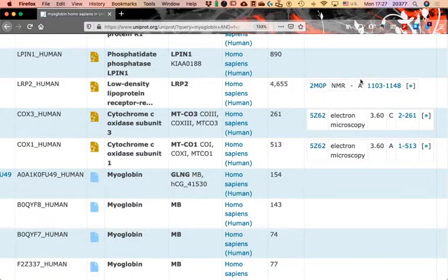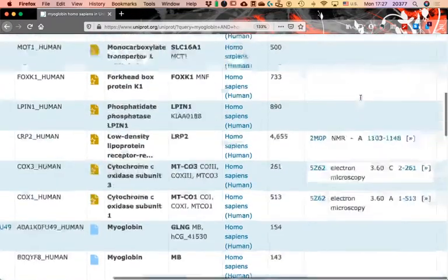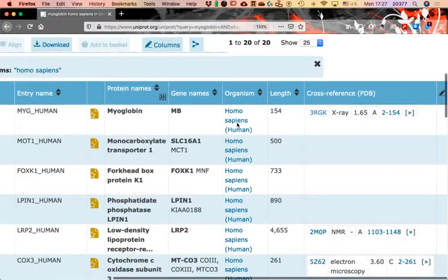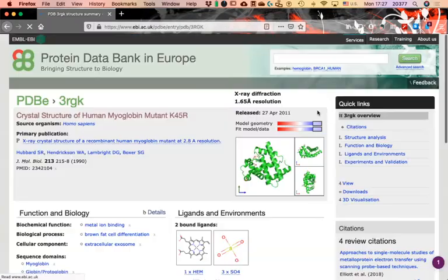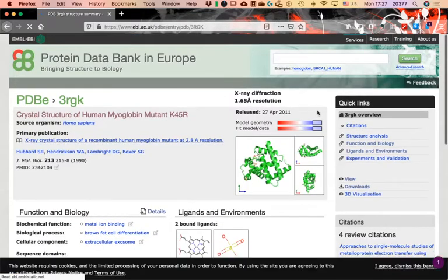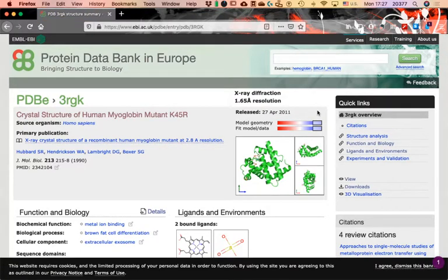We can go straight to the myoglobin entry and click on the PDB code, which will take us to the Protein Data Bank in Europe — to this page that we already know pretty well.